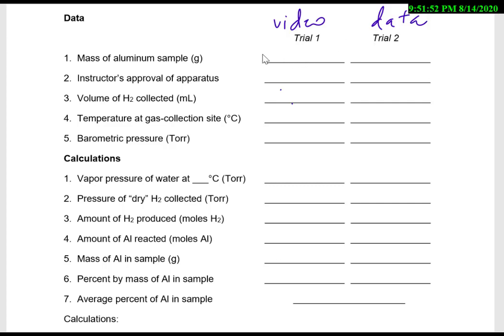So here's your aluminum sample that you're given. That's the amount of aluminum soft drink can. Here's your instructor's approval. So you're going to collect the volume of hydrogen, and in the video you'll be reading the burette to find the volume of hydrogen. You'll want to make sure that you read that burette to two decimal places for correct significant figures, and this will be your V value.